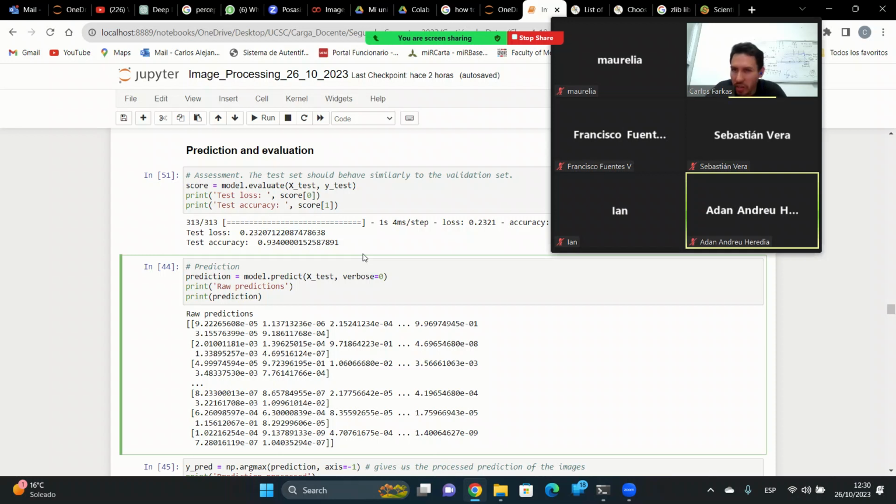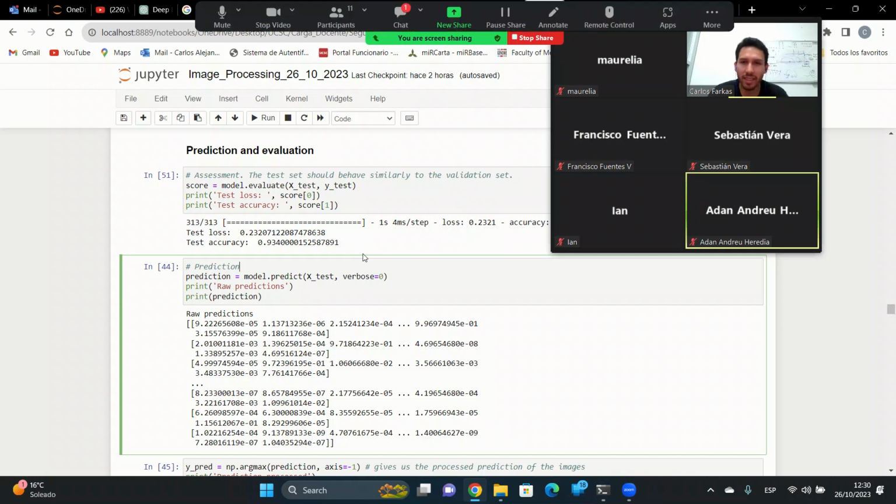Actually, that's very true. The noise could be affecting the predictions as well. Something we thought was noise actually is not. But the overtraining, I can say, for instance, is that the model tries to learn by memory. Have you ever memorized a speech, for instance? I did all the time at the university.